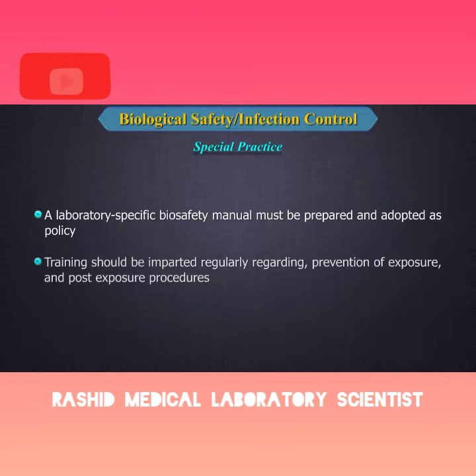2. Training should be imparted regularly regarding prevention of exposure and post-exposure procedures.